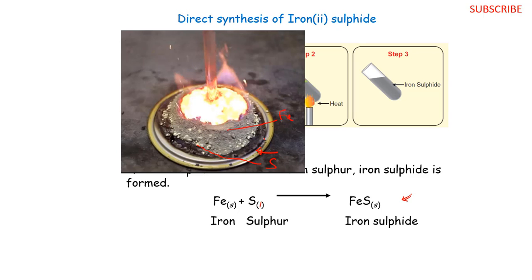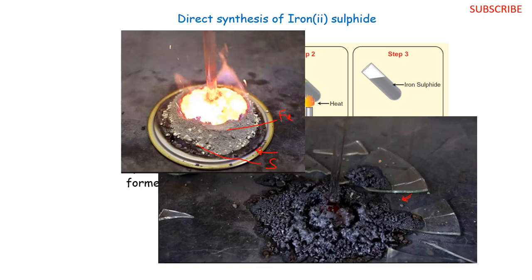So at around 100 degrees Celsius, our sulfur will melt and the reaction will start. Remember, like I've said, if you use glass, you can see what happens. Your glass can break. If your boiling tube is not strong enough to withstand high temperatures, it will also crack. And then we shall be left with our black iron sulfide.